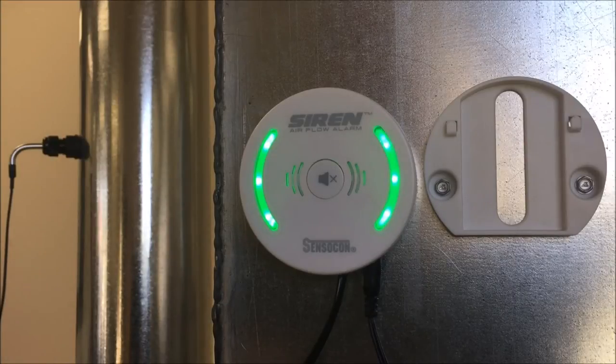An option that comes standard with each unit is the night setback mode. This option is available through use of the six position terminal plugs that are included with all siren units. For demonstration purposes, we are going to jump pin 4 and 6 in the terminal block.